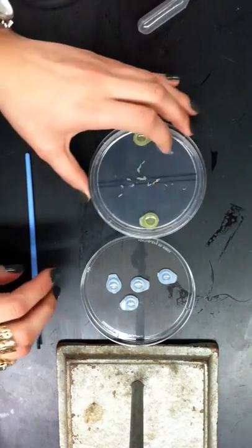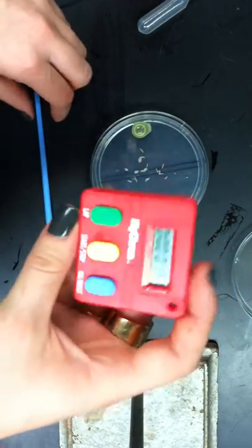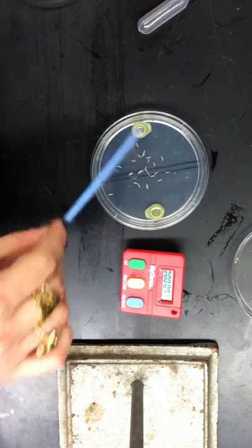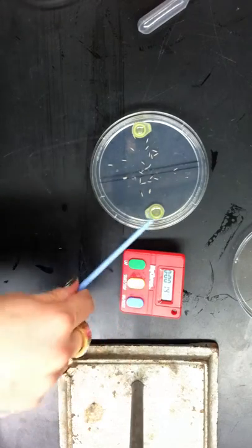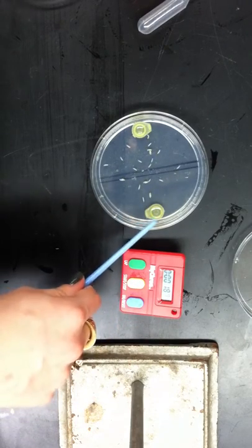Now you're going to close this and set the timer for three minutes. Wait until it hits three minutes, and after three minutes, you see they're crawling to either side. This is the AM and this is the BA, and since they were exposed to AM before, you'd hypothesize that if they remembered correctly, they'd crawl towards the AM because they were just exposed to it.